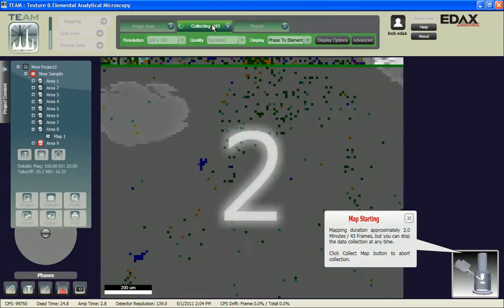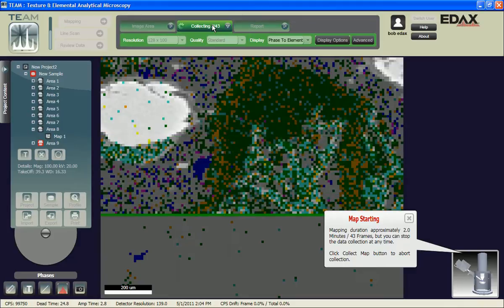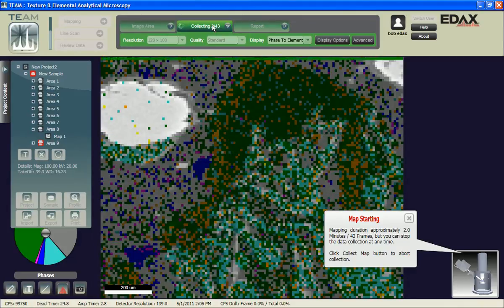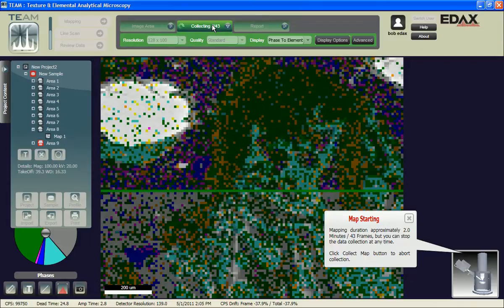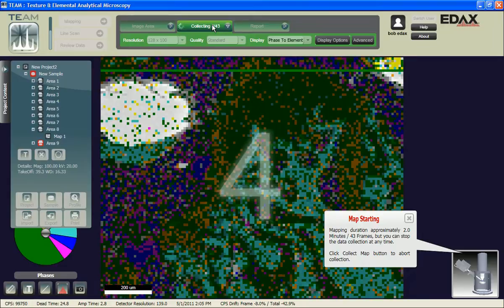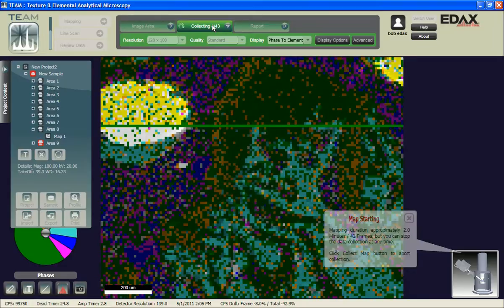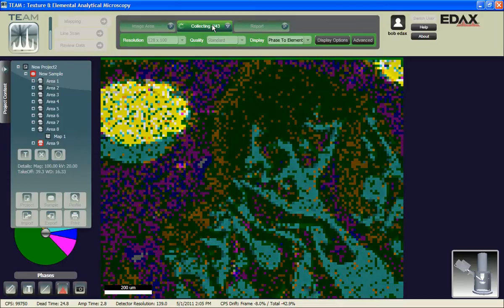Okay, so you can see the very first pass. Now we are collecting the map data, and I'm recording the movie. 2 fairly computer resource intensive programs. And so the mapping runs a little bit slower. So after another frame perhaps, I'm going to go ahead and pause the recording of the movie, and then we'll resume in about another 10 or 15 frames.